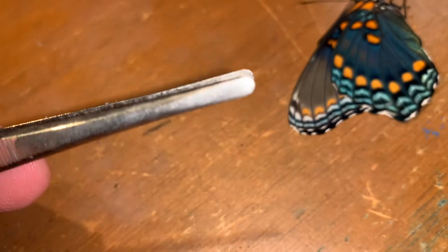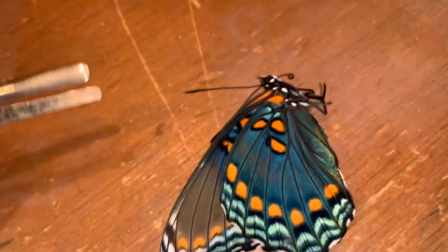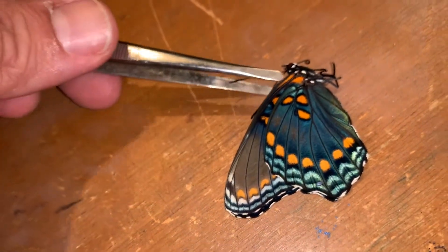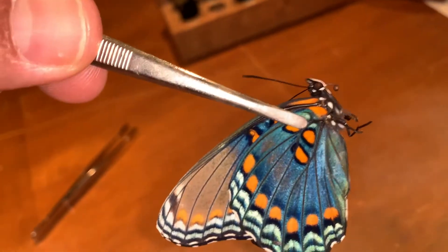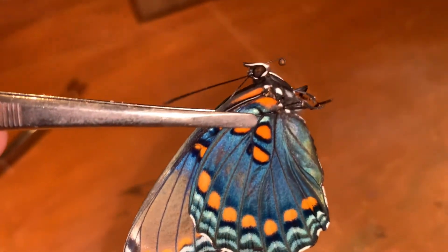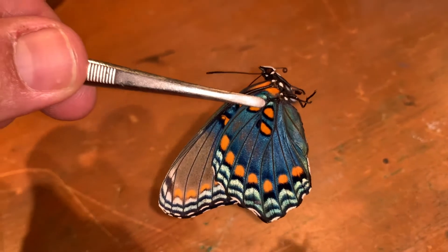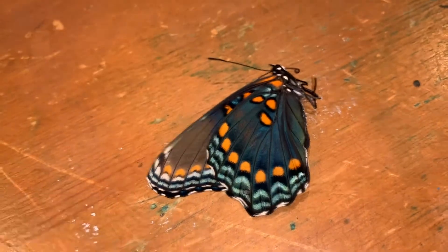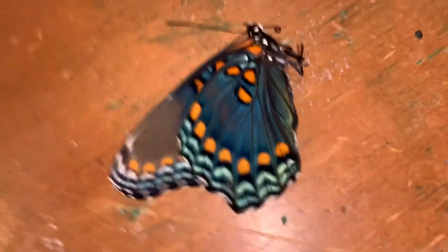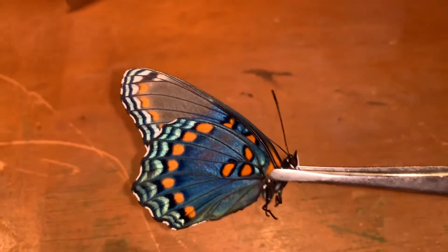I actually like using these little thin flat forceps — these are like medical forceps. You don't pick it up out at the wing tip. If you're going to pick it up by the wings, it should always be close to the body, picking it up by the forewing's main vein. When you do that you won't damage your specimen. But even then, you still don't want to apply much pressure. I like to handle my butterflies almost exclusively by the thorax.